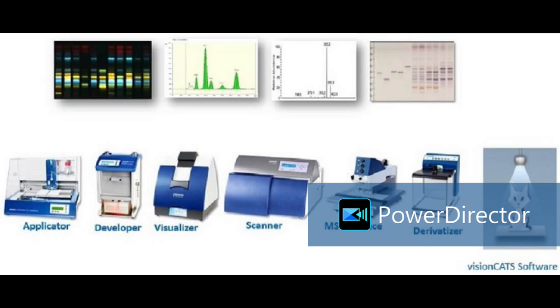And after spraying the reagent, sometimes we need to heat the plate. जैसे अमाइनो एसिड के केस में निनहाइड्रिन स्प्रे करने के बाद हम हीट करते हैं 110 पे या 100 डिग्री पे 5 minutes 10 minutes. For that we are using plate heater, Camag plate heater. Okay, this is specially designed by keeping TLC needs in front, by Camag technology. Here 20 to 200 degrees Celsius we can maintain.